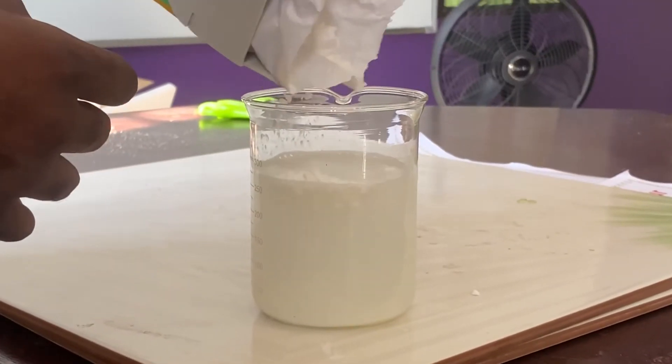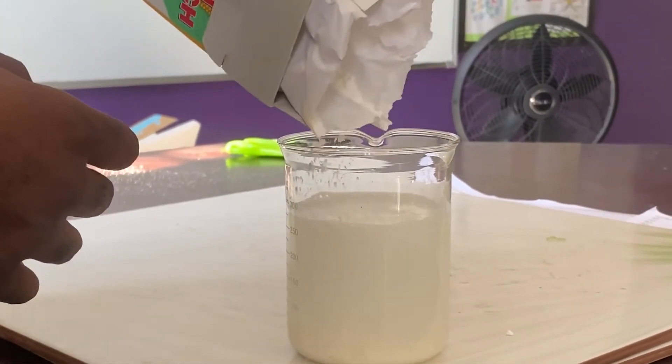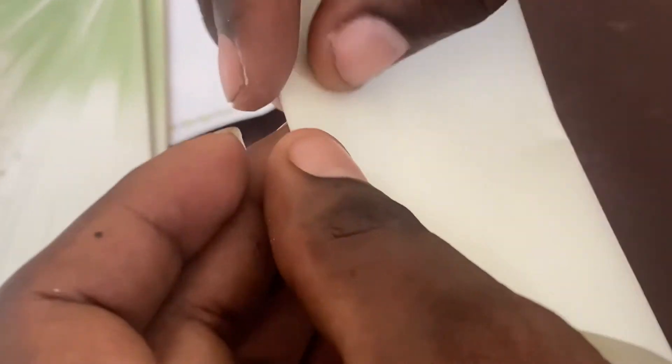For this lab, we will use a mixture of cornstarch and water. To ensure that the filtration takes place properly, the filter funnel needs to be fluted.